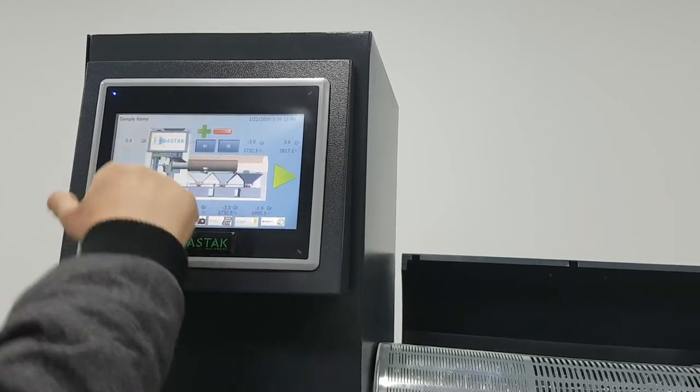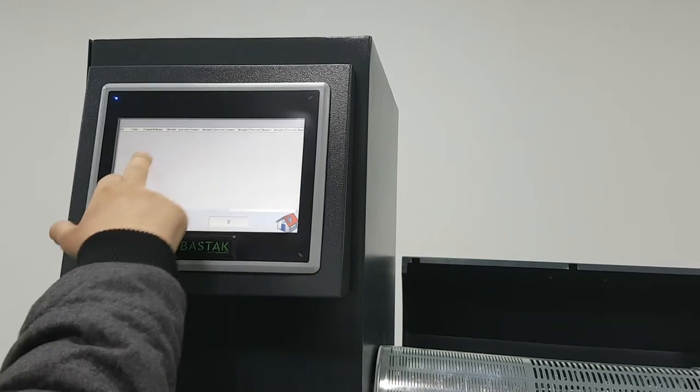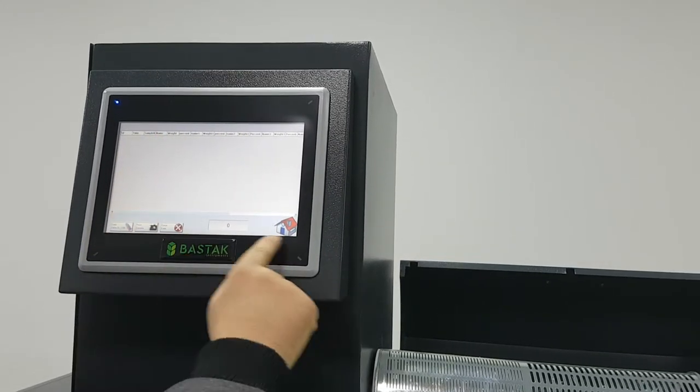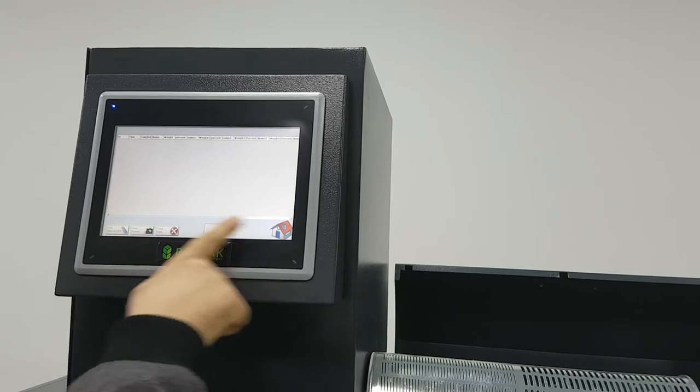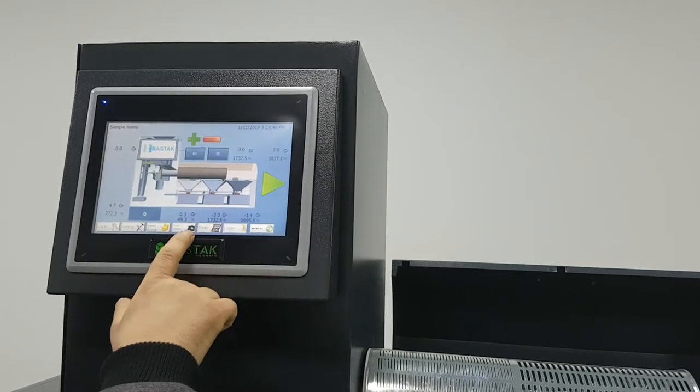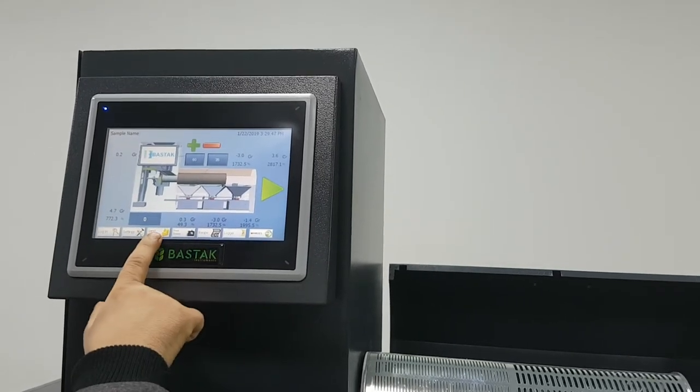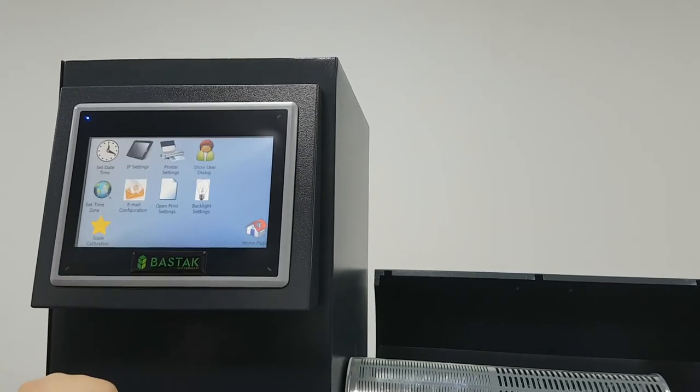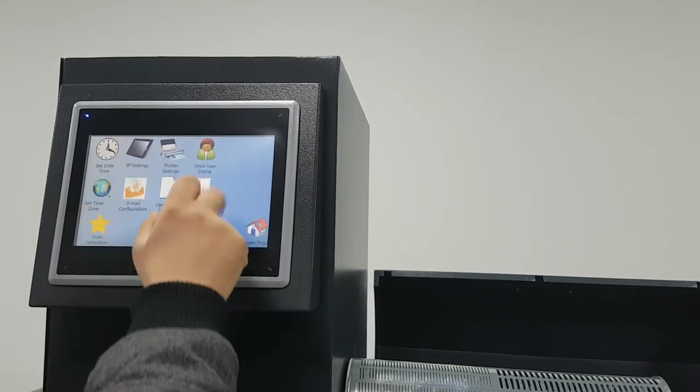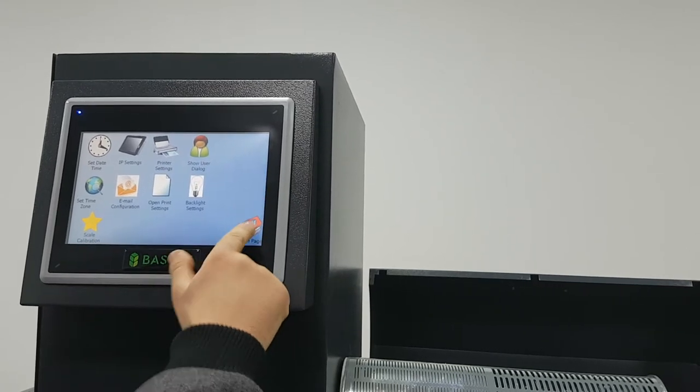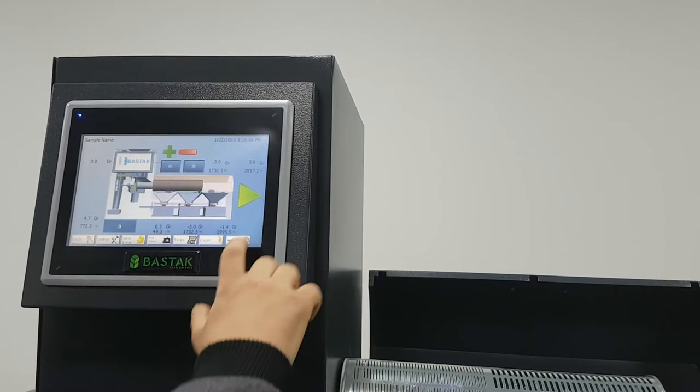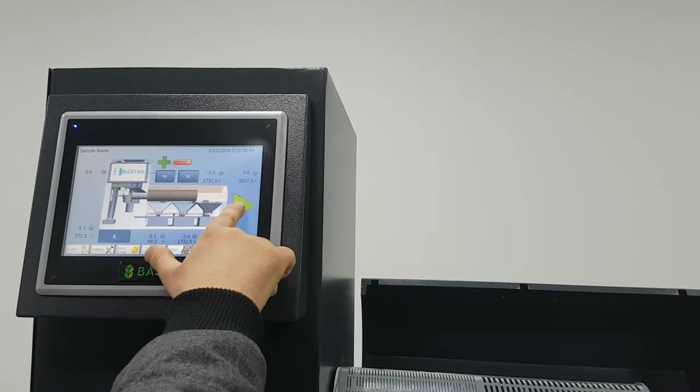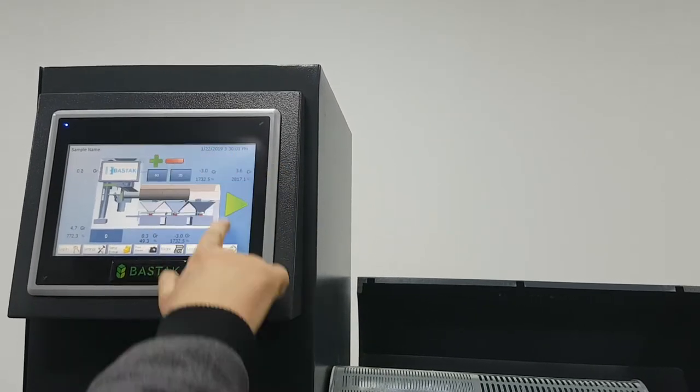We have the log here. Every test we do, we have the whole results saved. We can transfer it to USB. Also, we can send email for the results. Settings - time, printer, email settings, everything. Now I will show you that we start the machine when it's empty. We press start.